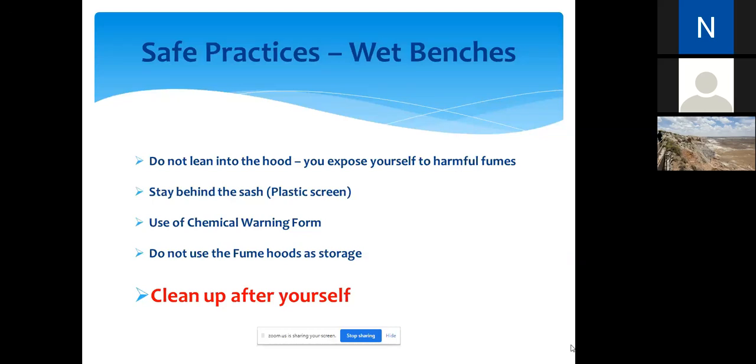You have to leave a note for the next person coming to use the area. Or maybe it's the technician. He sees the mess you left, and he will probably try and clean it up. Well, if it's your experiment and you didn't leave a note, then it's going down the drain.